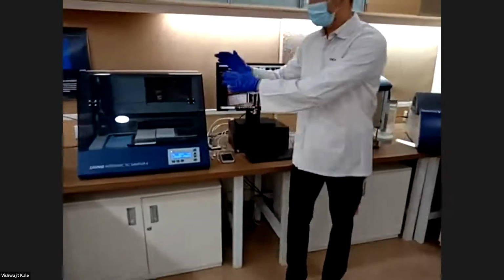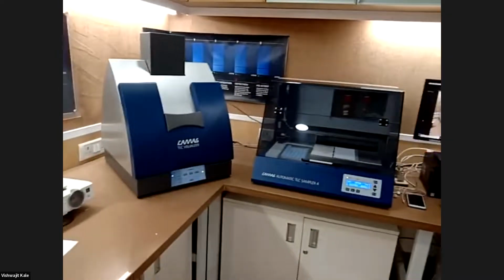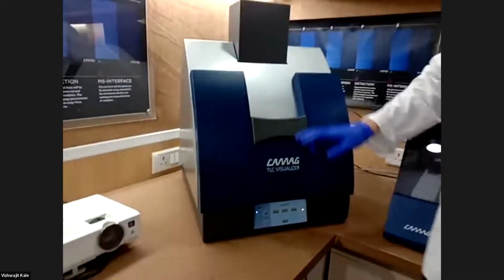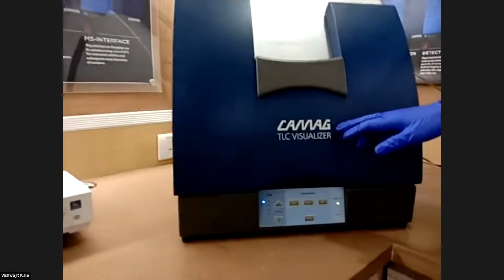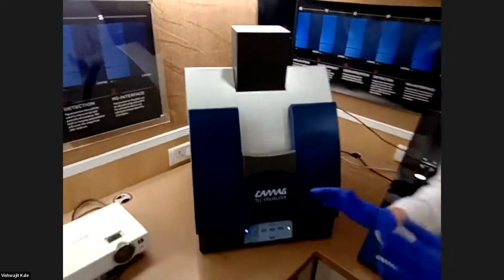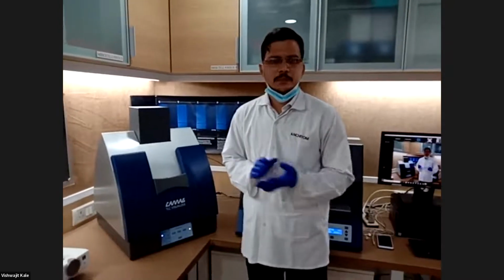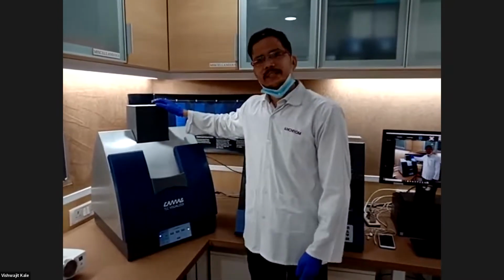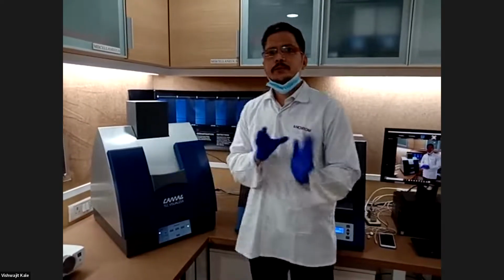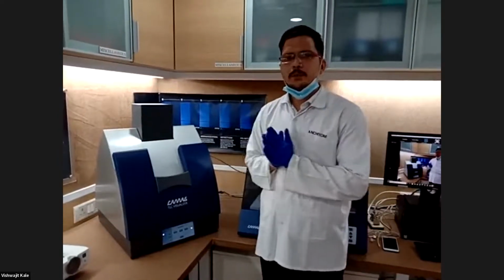So after sample application and chromatographic development, there is a next step involved in HPTLC analysis, that is photo documentation or visualization. So Camag TLC Visualizer 2 is the ultimate solution to capture the plate images under different illuminations. So we can capture the plate image under UV light, white light, as well as fluorescent light. There is a highly sensitive industrial grade camera fitted inside this visualizer, and there are 3 lamps to illuminate any desired wavelength in UV region or visible region or fluorescent region.